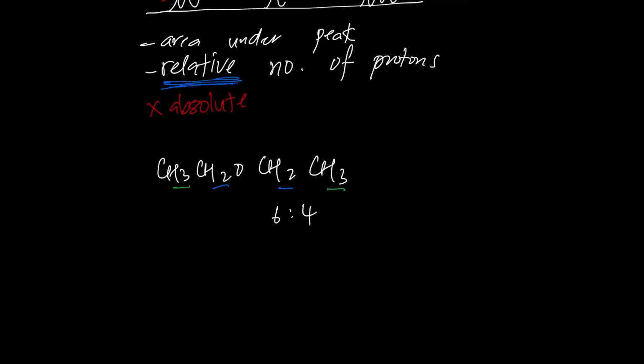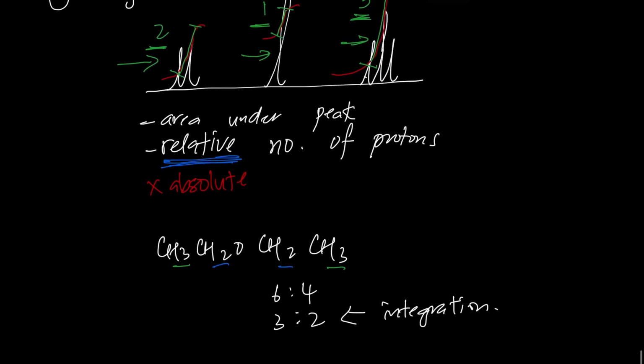The integration for the two signals is given by 6 protons versus 4 protons, but for the integration you'll find 3 to 2, because integration is the relative number.